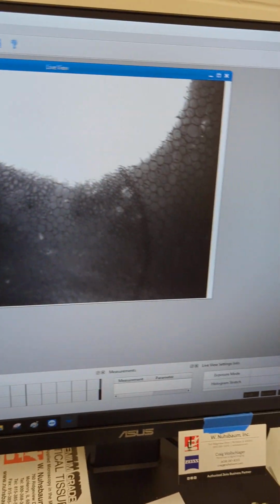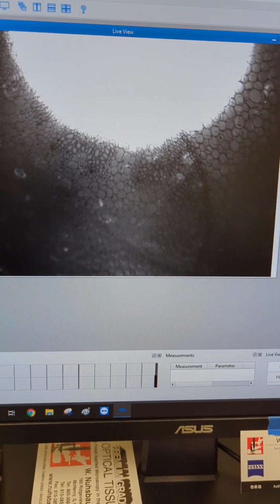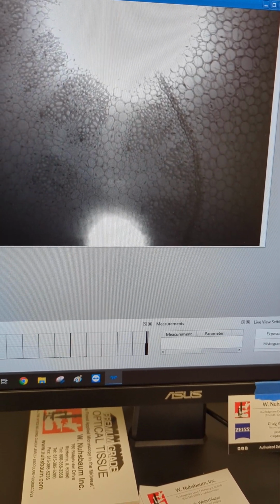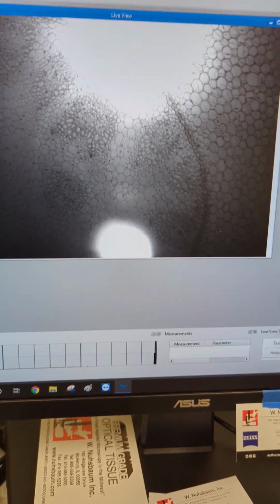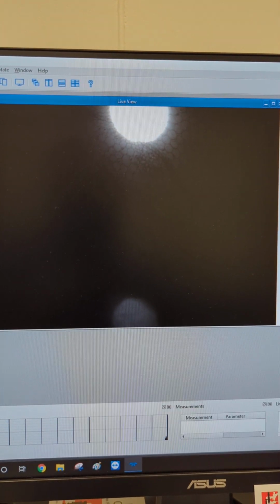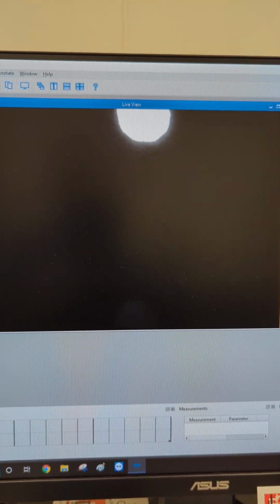So what I'm gonna do is show you the screen, but I'm gonna do it in the eyepieces where I'm used to doing it. That's where you should really see it. So right here is perfect. And let me turn the auto off so that we can actually see what I'm looking at. Oops. So this is what I see in the eyepieces. Sorry about that. See how it's nice and crisp edges. This is not crisp.